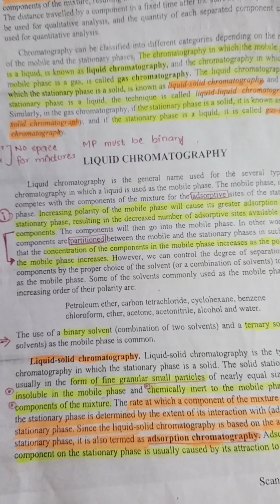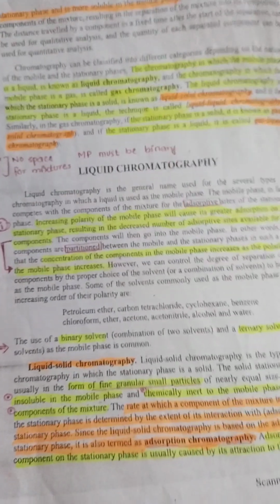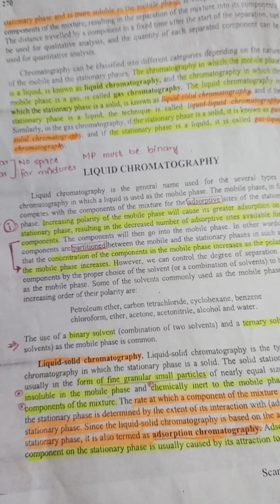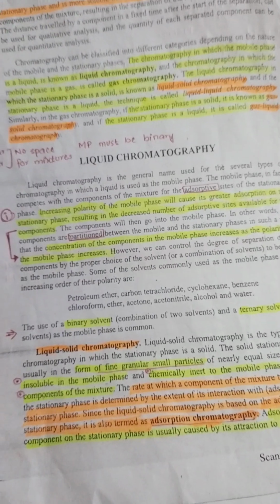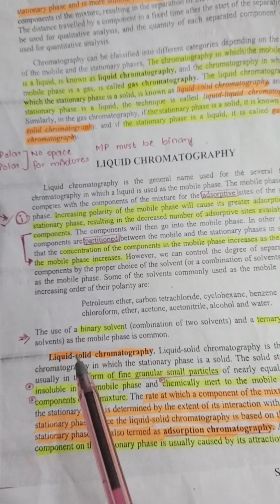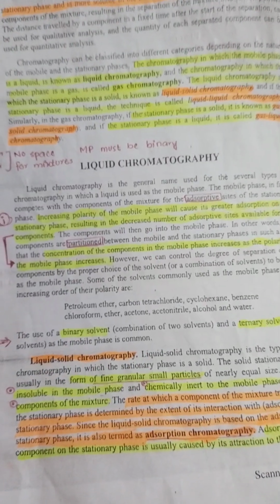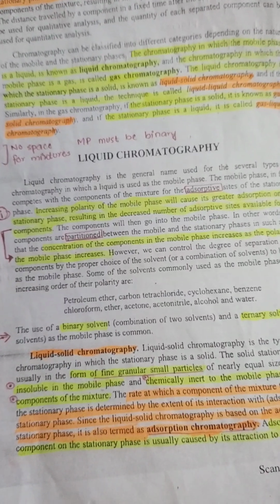Now, in liquid chromatography, what is important? Its stationary phase nature and its mobile phase nature. Mostly our stationary phase is polar, and for the mobile phase, the preferred choice is a binary solvent or ternary solvent. That is good for the separation of a mixture into its components.